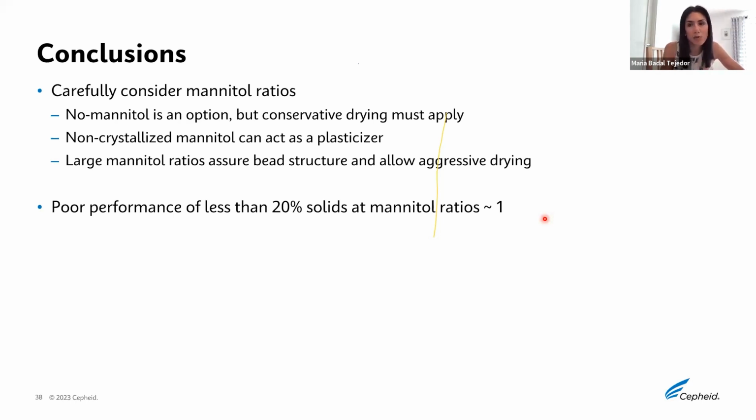I mean, there is still room for testing a smaller amount of solids and then having either no Mannitol in the formulation at all, or having a high amount of Mannitol. In that case, perhaps we can still have a bead that is round, nice, and holds the structure, but that has to be tested.